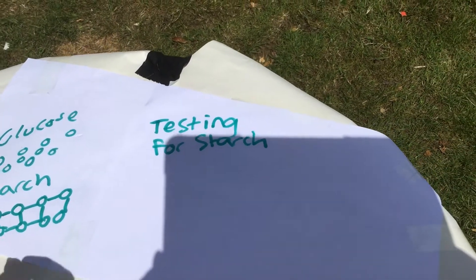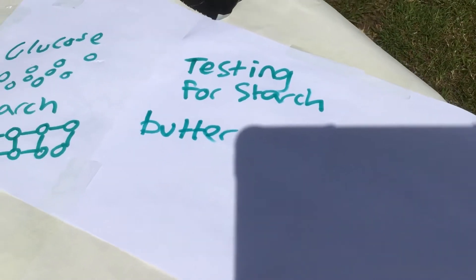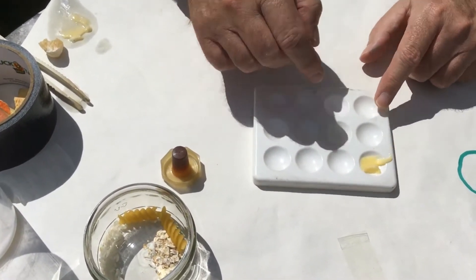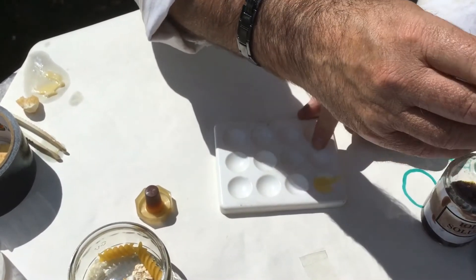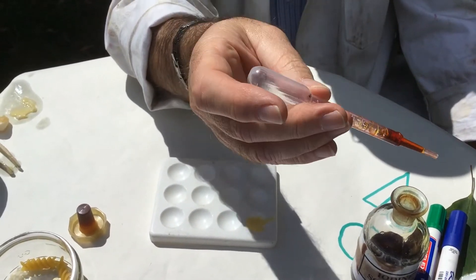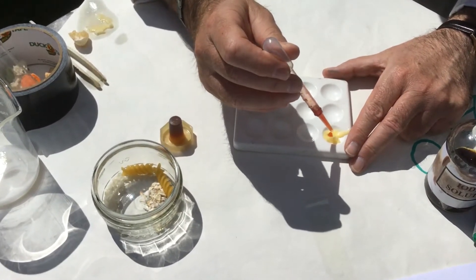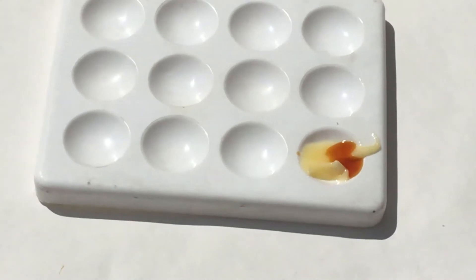The first one I'm going to try is butter. Butter is known as dairy, and dairy comes from cows along with milk. I'm putting the butter on this spotting plate. There's a bit too much in there. There's a piece of equipment we use a lot in science — find out what it's called and let me know. Now, looking at the result, there's no change. So we could say butter — no, it does not contain starch.